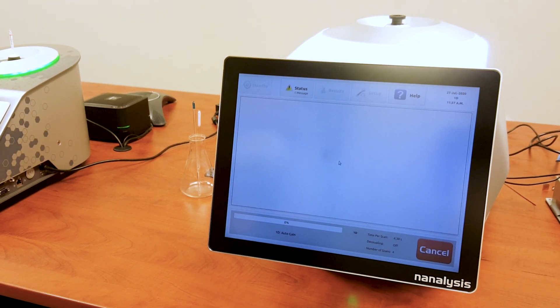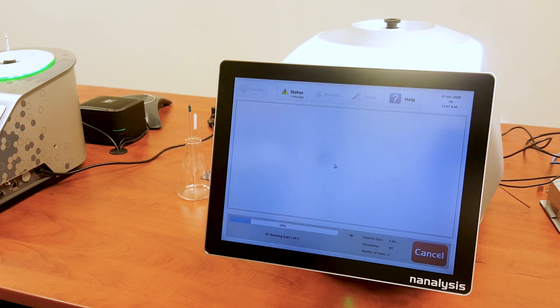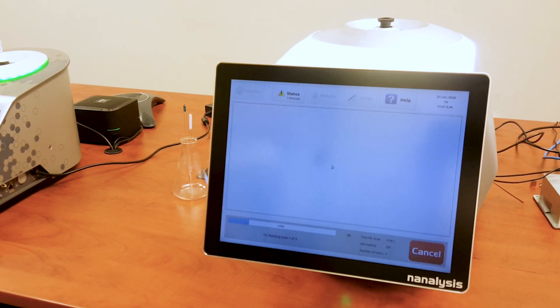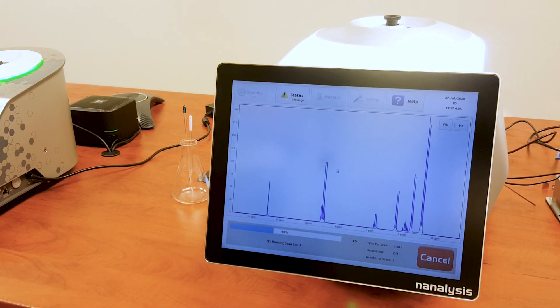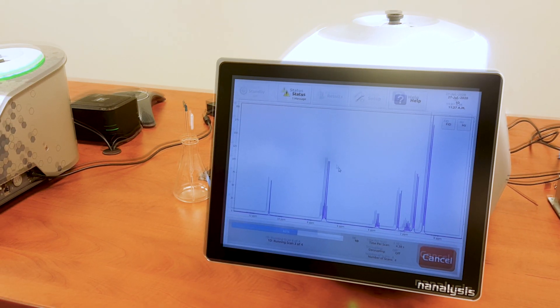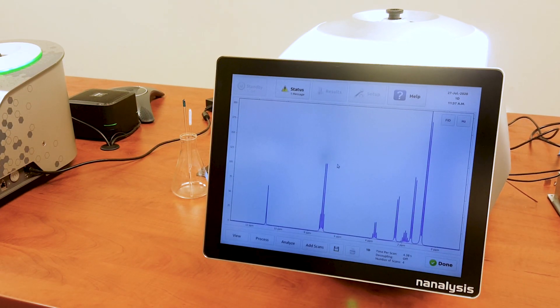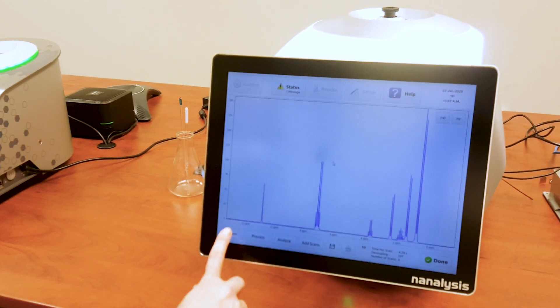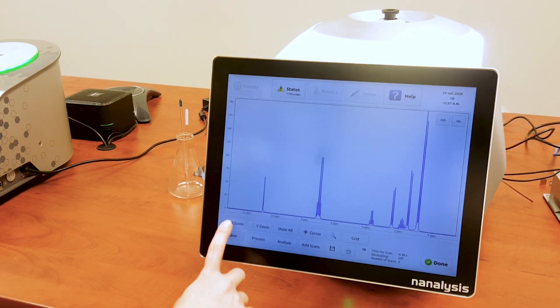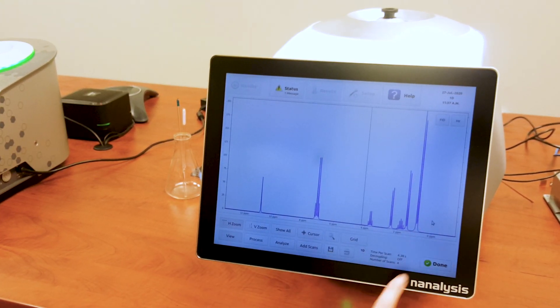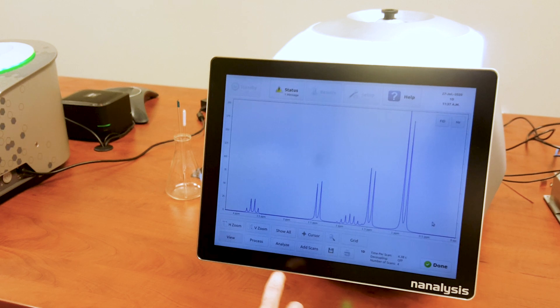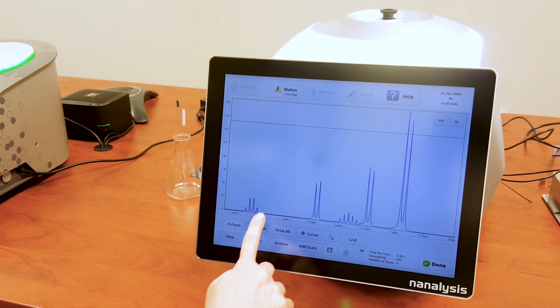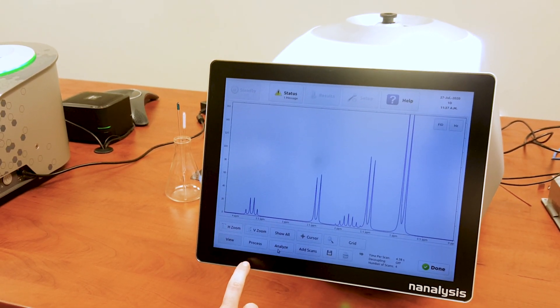The instrument will perform an automatic receiver gain, show the first scan and update every four scans. From here, the user can see the FID, zoom into regions of interest, phase, integrate, and perform baseline corrections very easily.